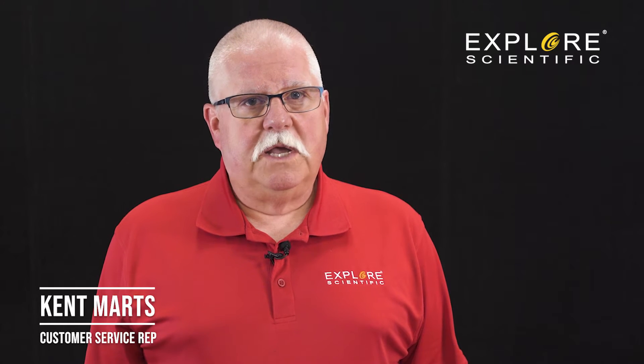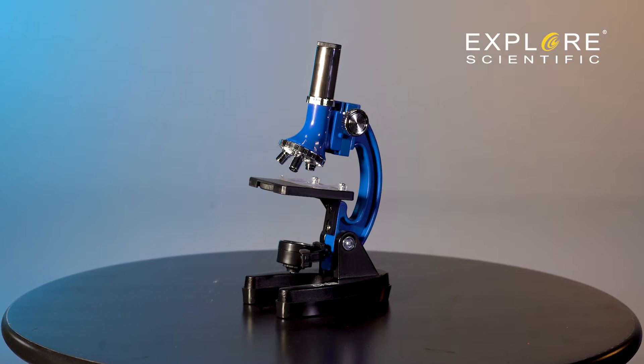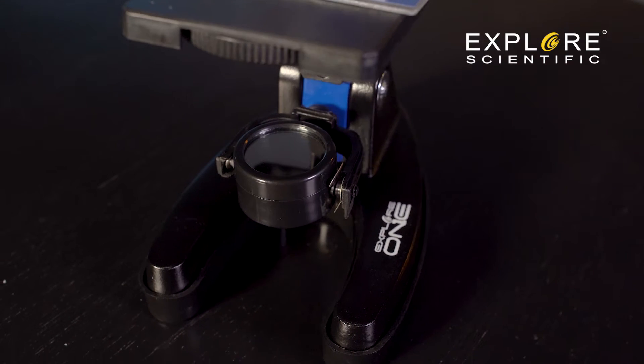I'm Kent Martz and work in customer service at Explore Scientific. We will be using the Explore One 900 power microscope for this tutorial.